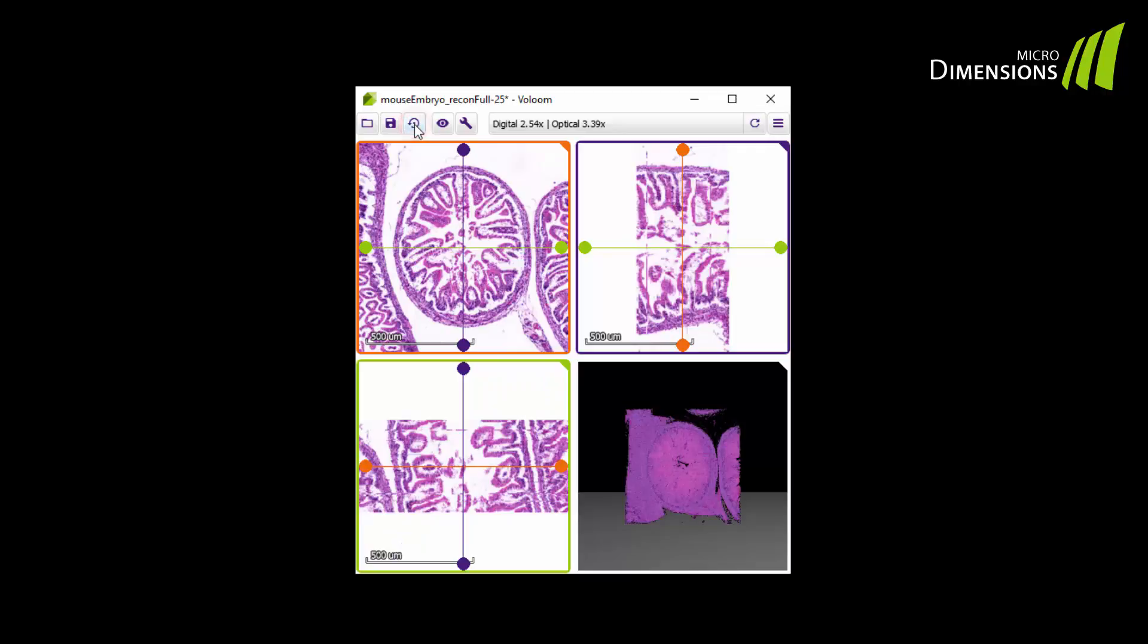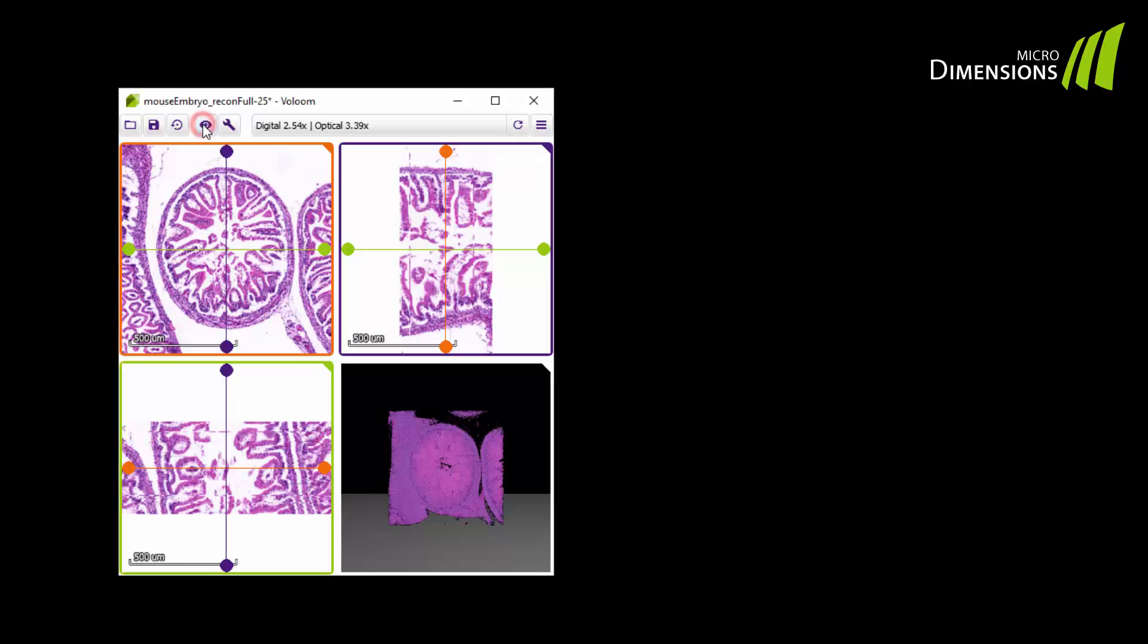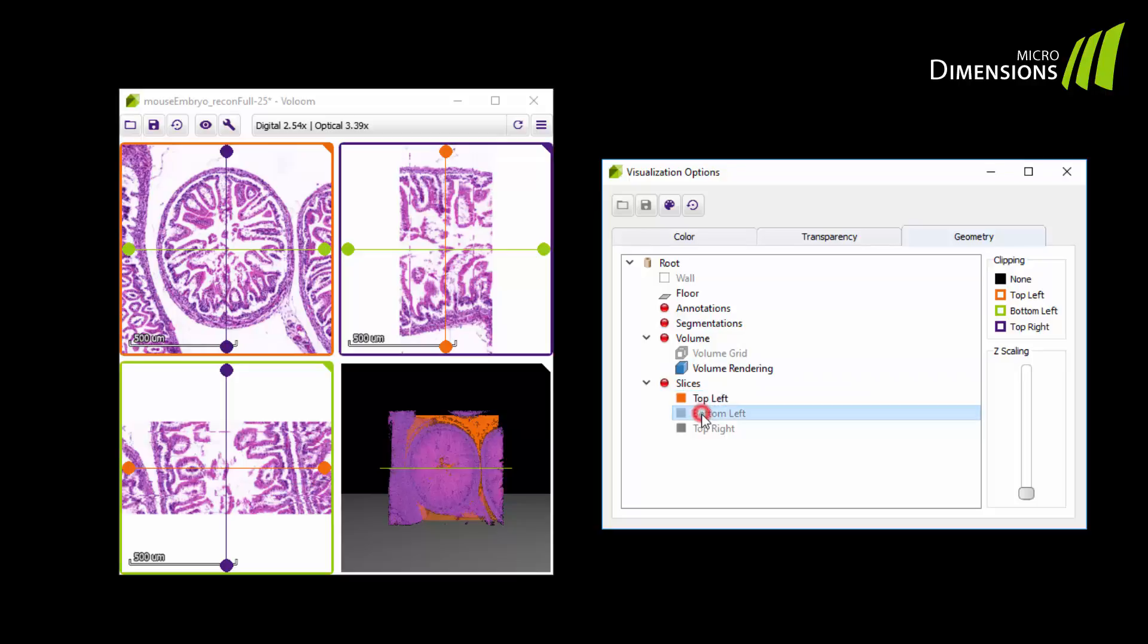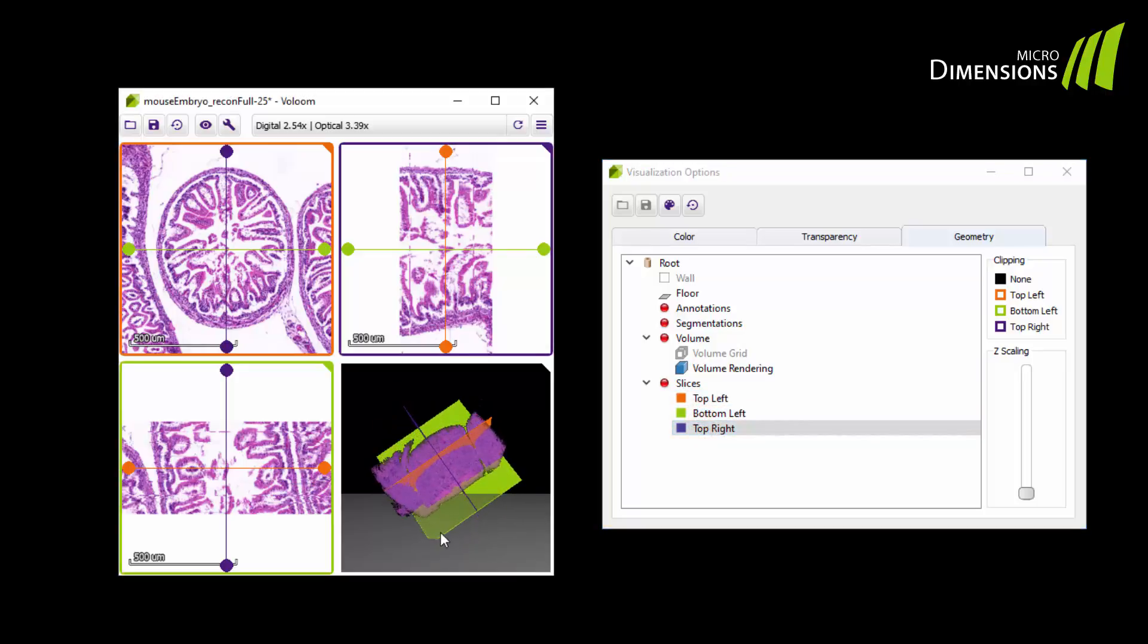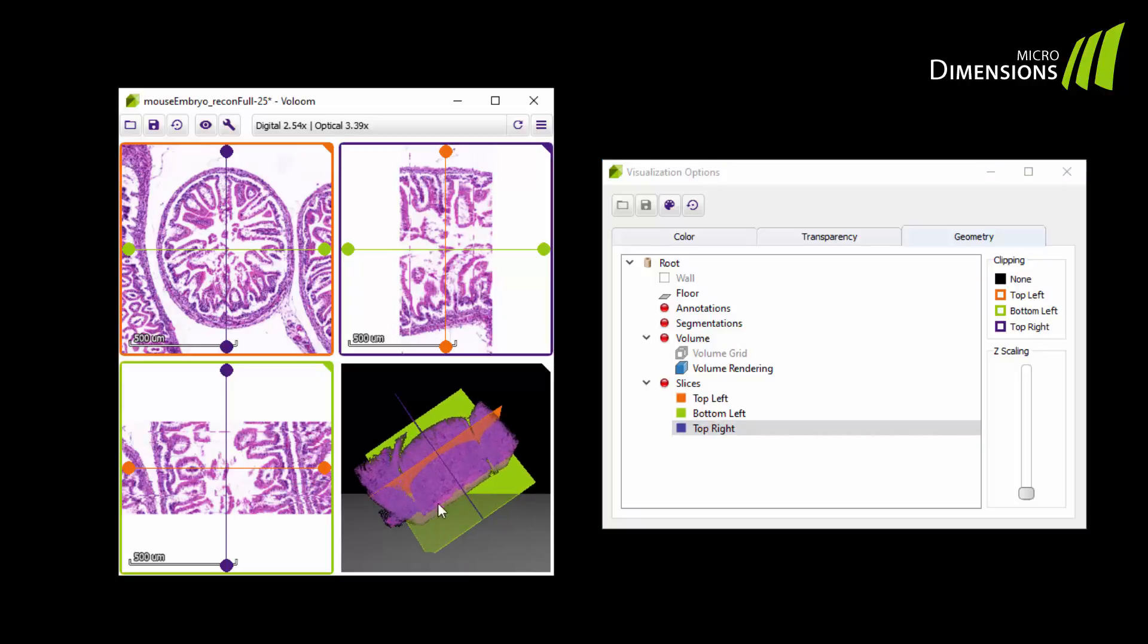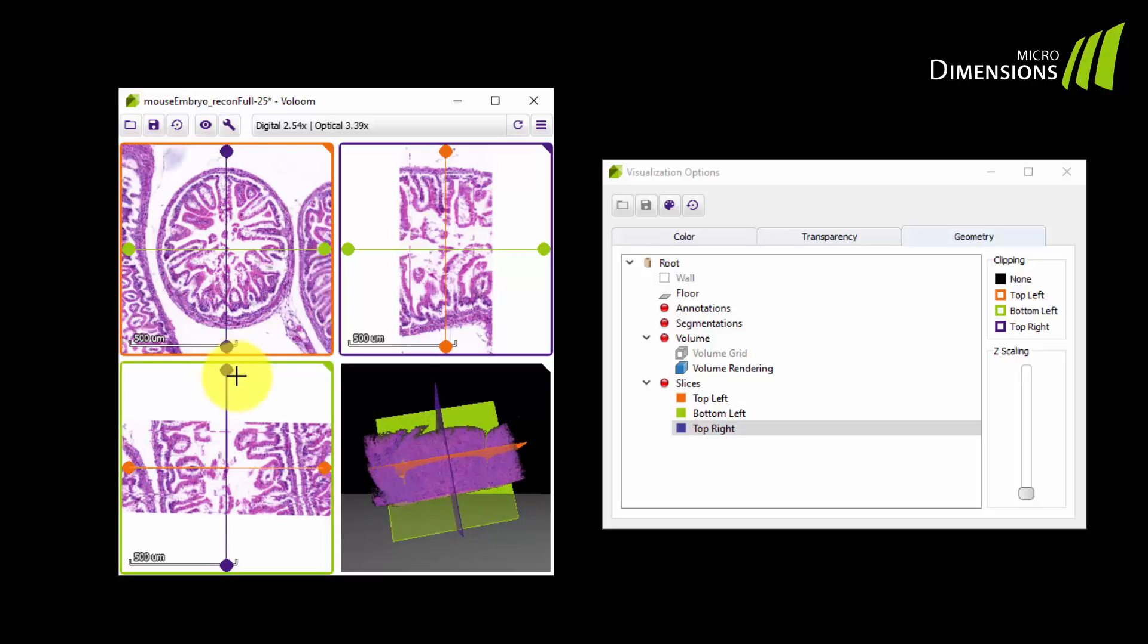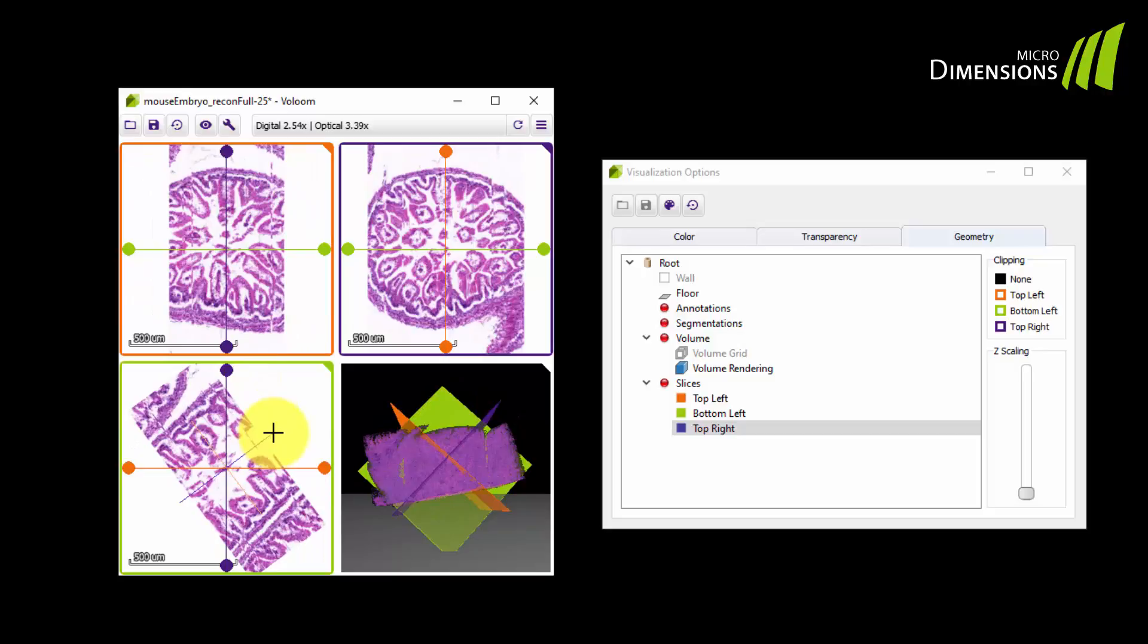Now I will show you different visualization features. Click on the button visualization options to open the editor. We will start with the geometry tab. The slices can be activated by double clicking. With the slices option you can visualize different slices represented by the crosshairs within the reconstructed volume. This feature is especially helpful for your orientation when you create virtual cutting planes.